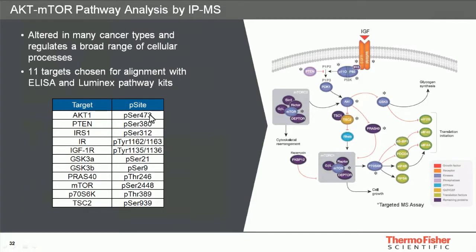We also selected 11 phospho targets for each one of these targets, and they are listed here in a table that targets specific phospho sites.